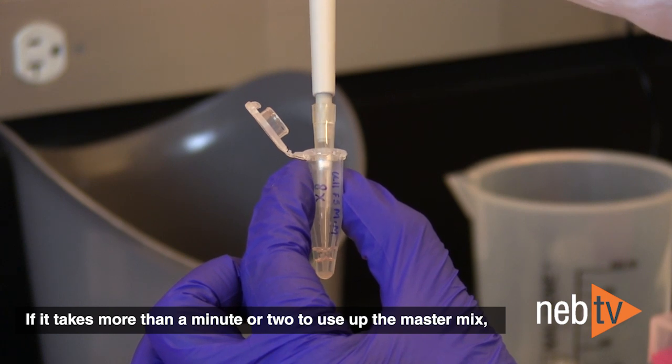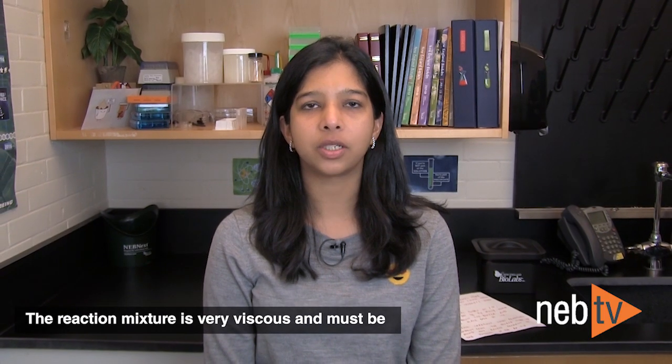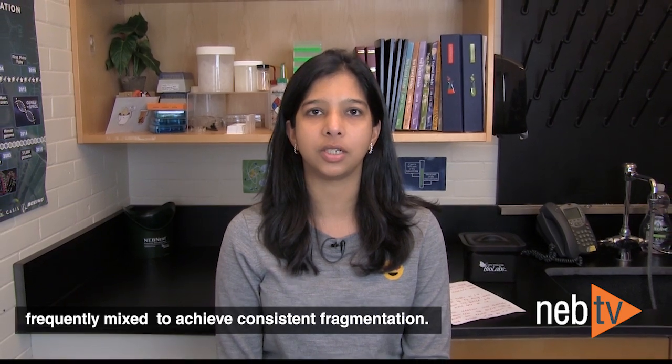If it takes more than a minute or two to use up the master mix, pipette it up and down prior to use. The reaction mixture is very viscous and must be frequently mixed to achieve consistent fragmentation.